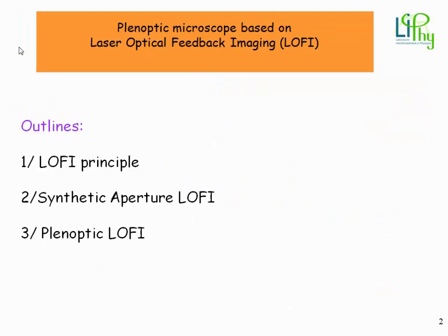So the outline of my talk: firstly, I would like to explain to you the principle of the LOFI method, which is based on frequency-shifted optical feedback. Secondly, I would like to briefly recall the synthetic aperture imaging method, mainly used in the radar domain, and how it can be extended to the optical domain. Thirdly, I would like to explain how it is possible to build a plenoptic microscope by using the synthetic aperture LOFI signal.